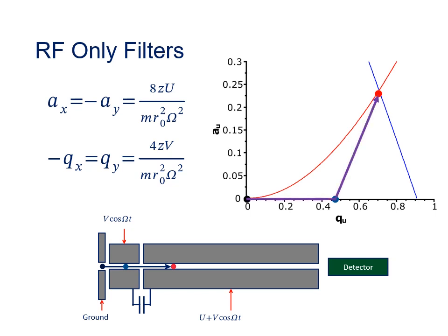So now if we look at how the voltages changed as the ion entered the quadrupole, we can see that it stays inside the stable region through the entire transition. And that's why adding these Brubaker filters, RF only pre-filters, or stubbies, improves the sensitivity of quadrupoles.